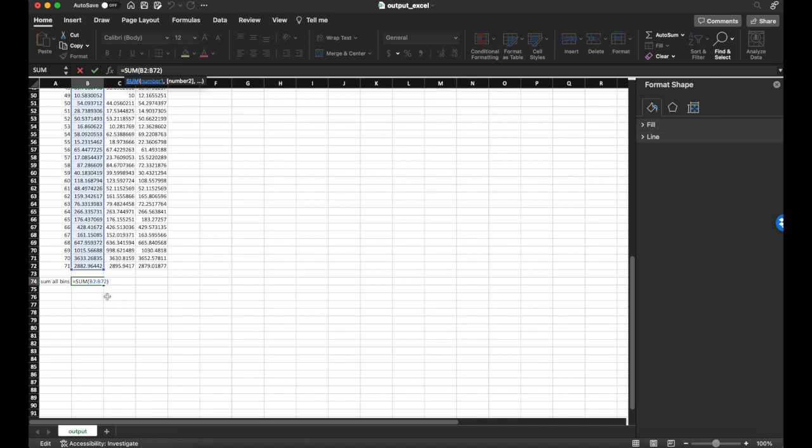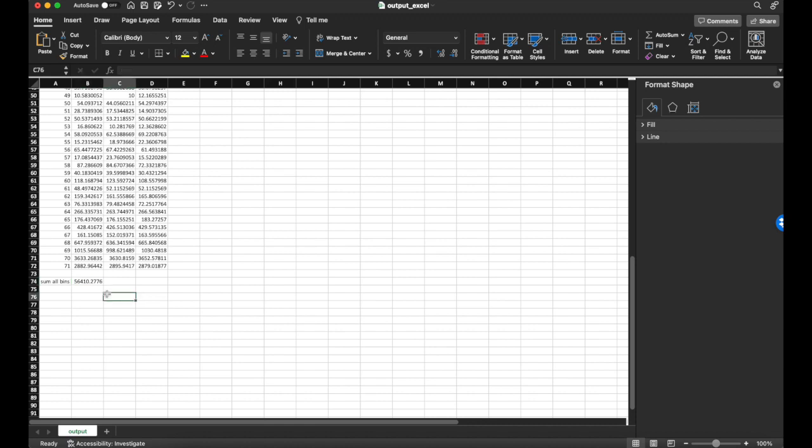To get out of editing mode, press escape. There you go. If you're in editing mode after you double click and you accidentally type something in, that's going to cause an error, and it's okay if you type multiple things in. To get out of editing and to undo all your typing, just press escape, and it reverts back to the original equation. So again, if you're in editing mode and you accidentally type something, which happens, just press escape to go back.